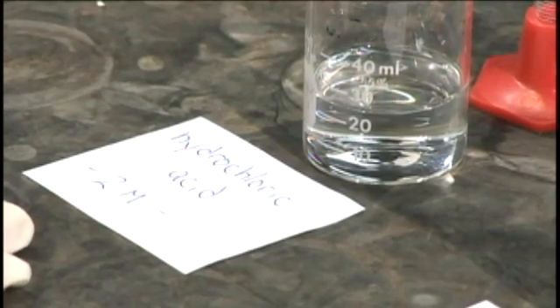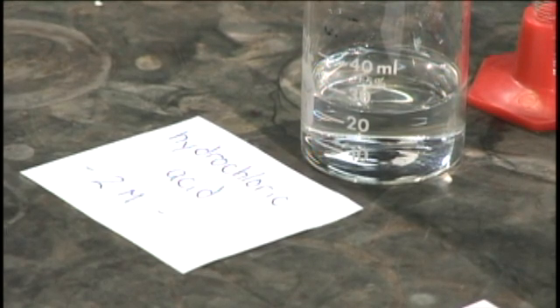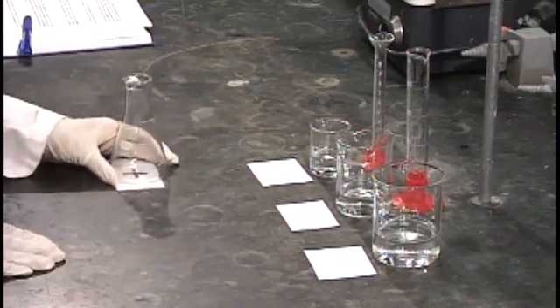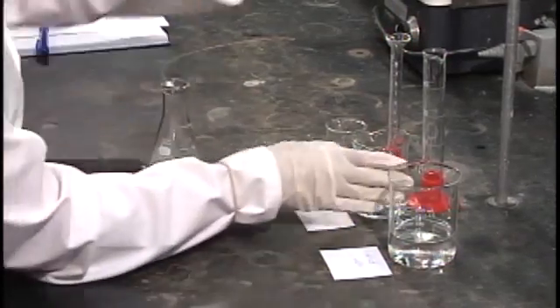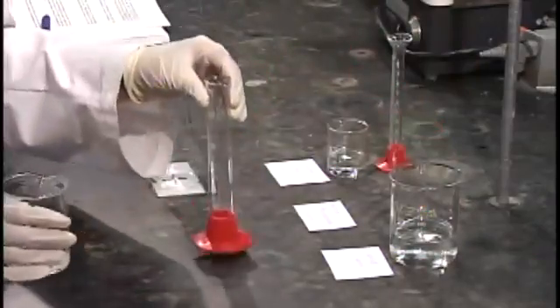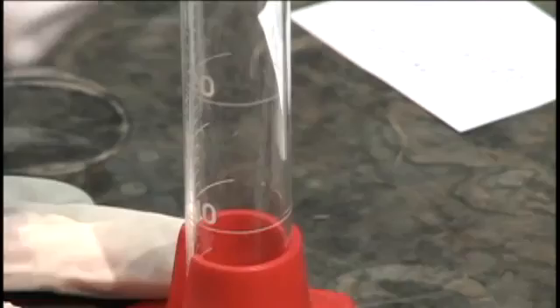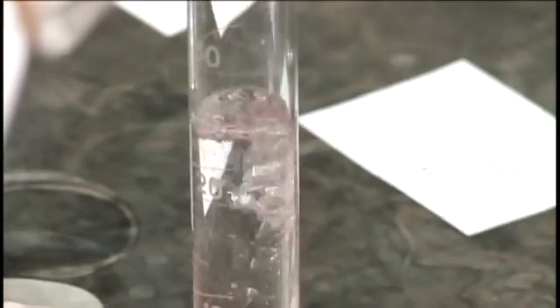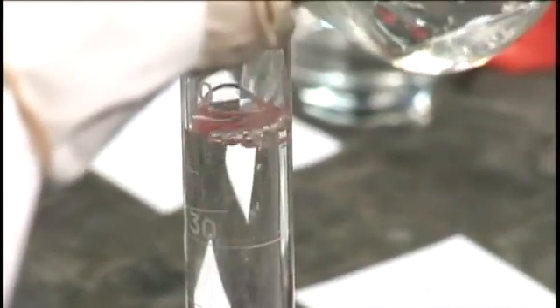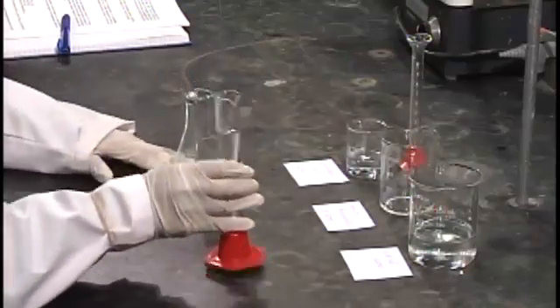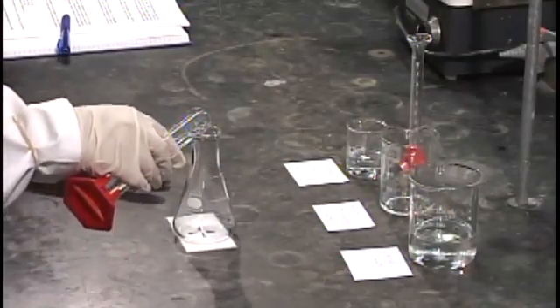We're going to be starting not with 45 milliliters of sodium thiosulfate, but with 40 milliliters. We'll measure out, in a graduated cylinder, 40 milliliters of our 0.2 molar sodium thiosulfate and pour it into our flask.